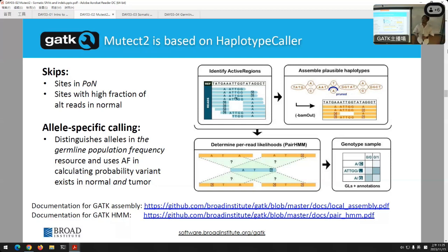Sorry, you have a question? That's a really good question. Do we have to separate by gender? I mean, the main difference we'd see is, of course, a Y, right? There are different copies of the X. I don't know though. For the copy numbers, you'll see you have to separate. So for some, yes, for copy number, yes.